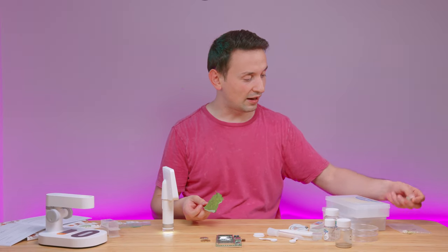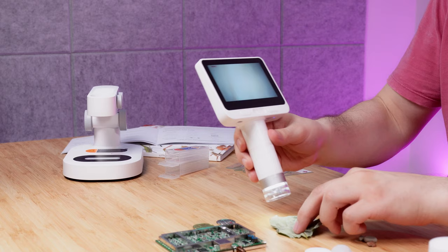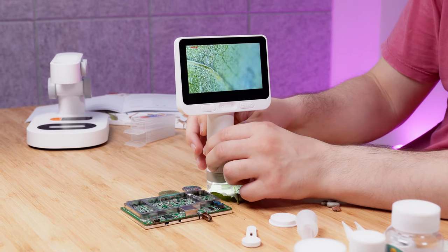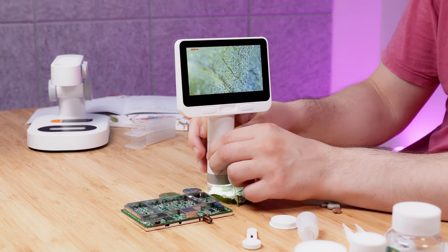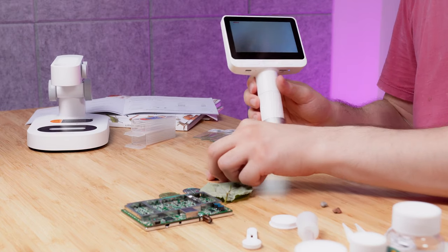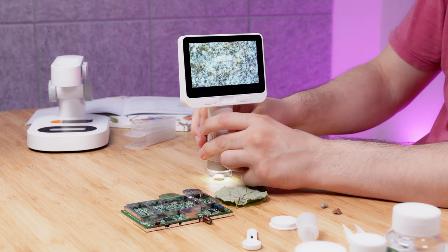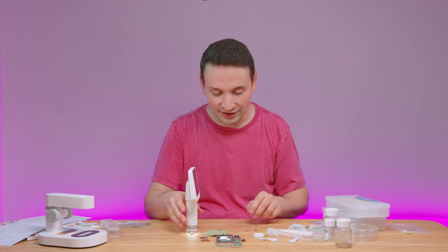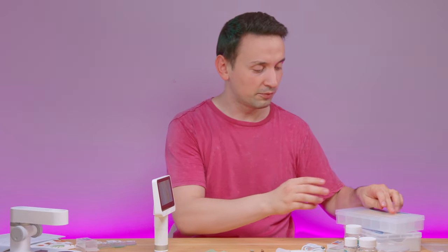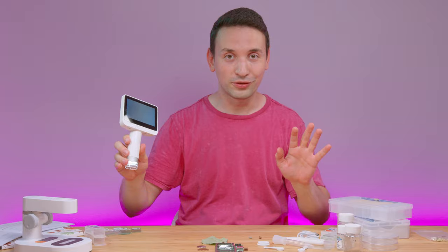I picked up a few things from outside — some rocks and a dried-out leaf. Looking at the leaf, there's a lot of detail, and if you zoom in a little further you can really see it. These are the kinds of things you'll look at if you bring this outside. And you have all those containers to put specimens in, label them, and so on.